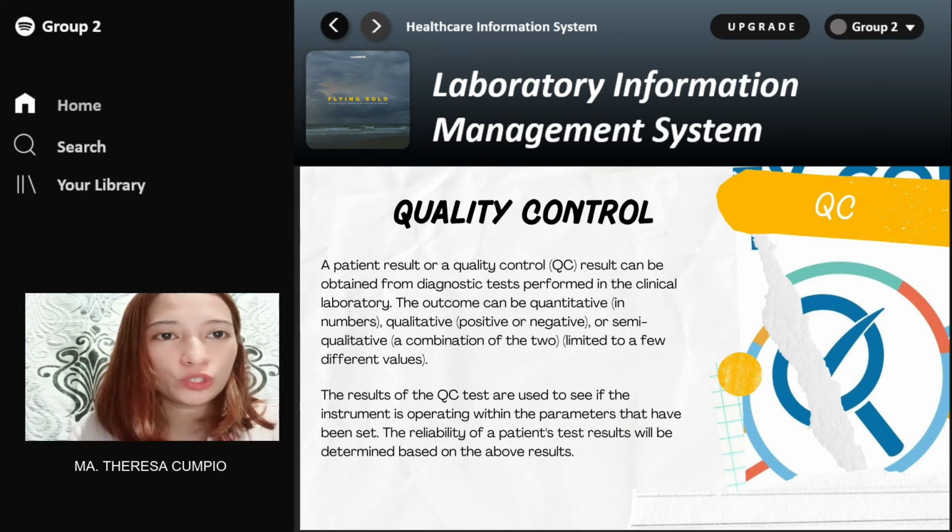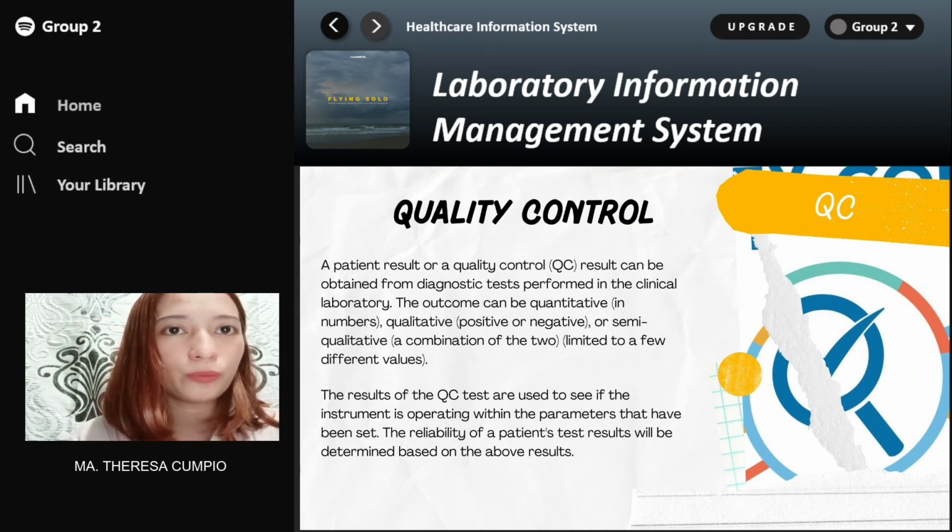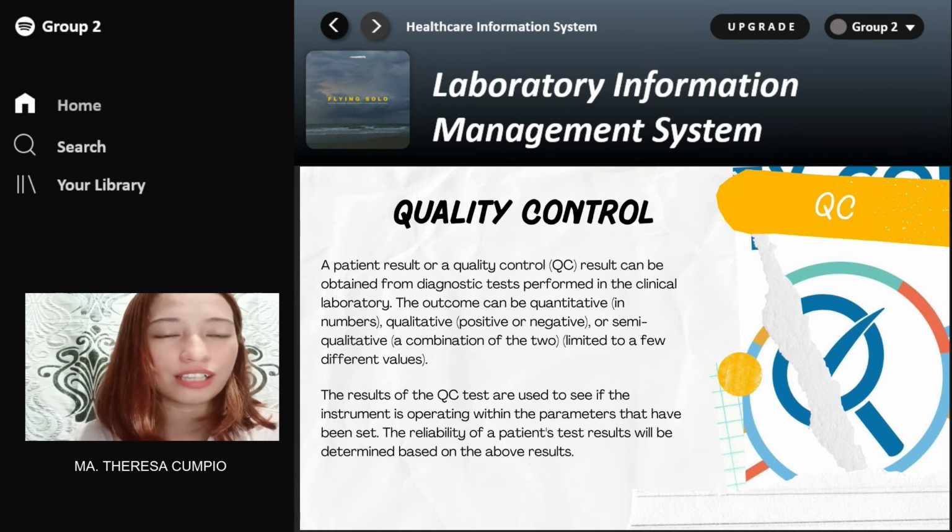The quality control in LIMS is the process of assurance of quality at every stage included in the automation system. It may also be called a statistical process used to evaluate the analytics produced in the patient's results. The sampling product is continued after every successful stage until the end of the sample management process. Quality control is very essential in LIMS used in clinical laboratories as the results cannot be tampered with.